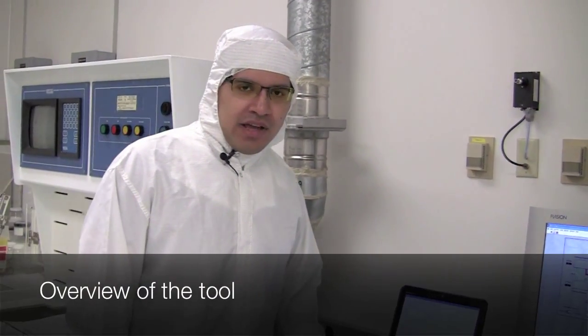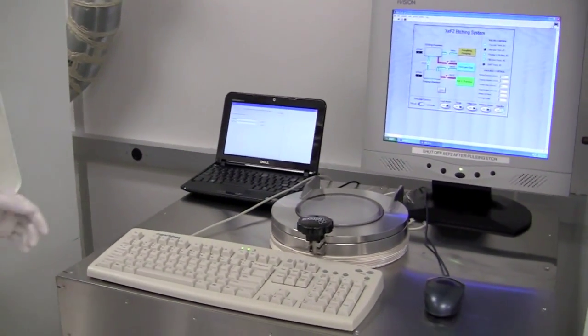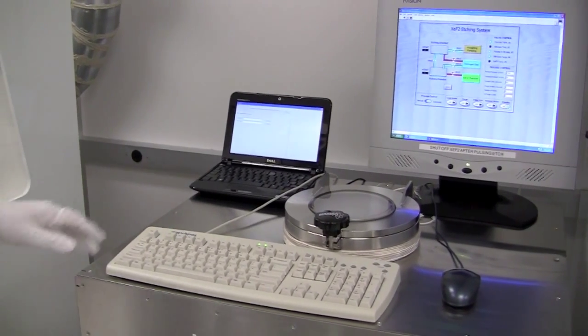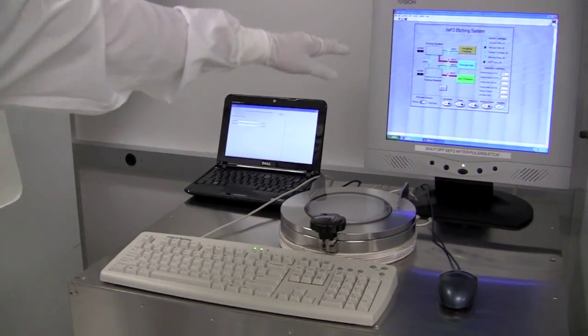So with all that theory out of the way, let's look at our tool. This is our xenon difluoride tool. I'd like to point out three things. We have an etching chamber here, we have our login computer, and then we have our control panel here.